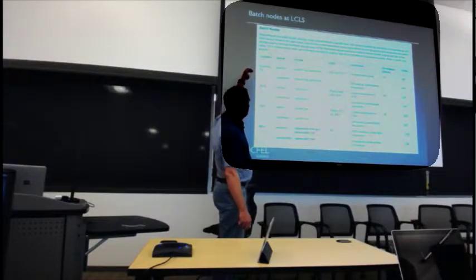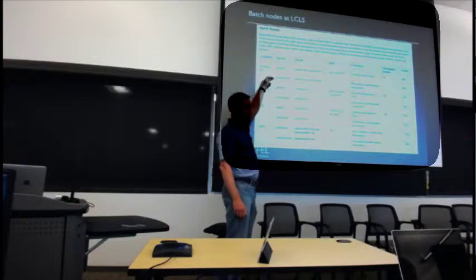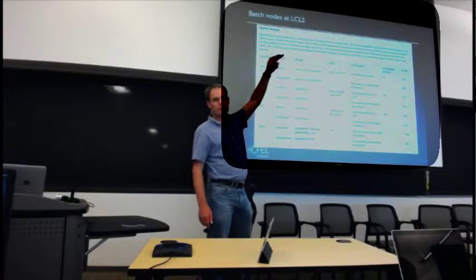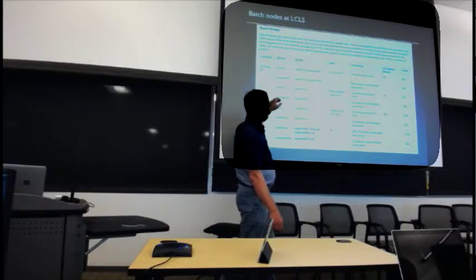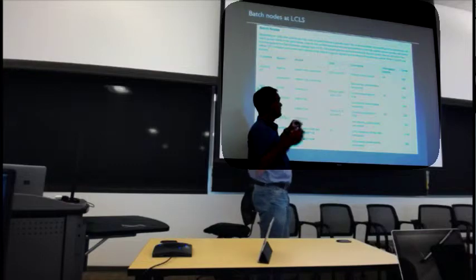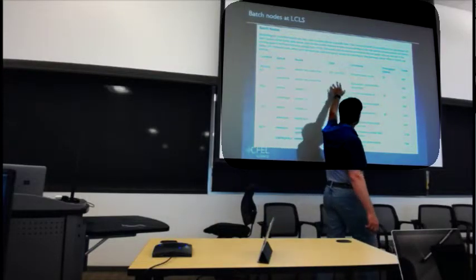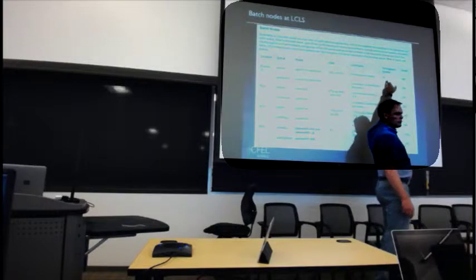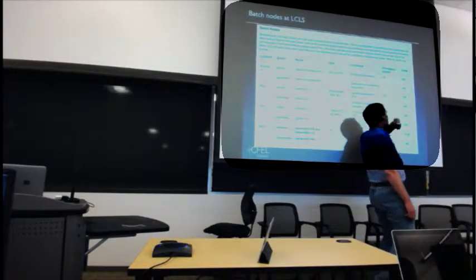So the way I've set up the tutorial is to use this PSANA queue. It runs on the data stored on the big spinning disk arrays. It can see all of the data going back into whatever history is stored there. The reason I picked it for the analysis is that its throughput to the disks is somewhat higher, so you're less likely to get I/O bound.